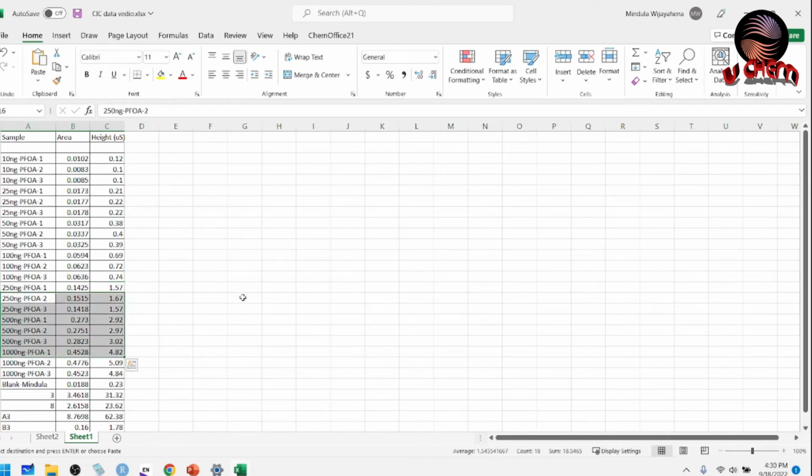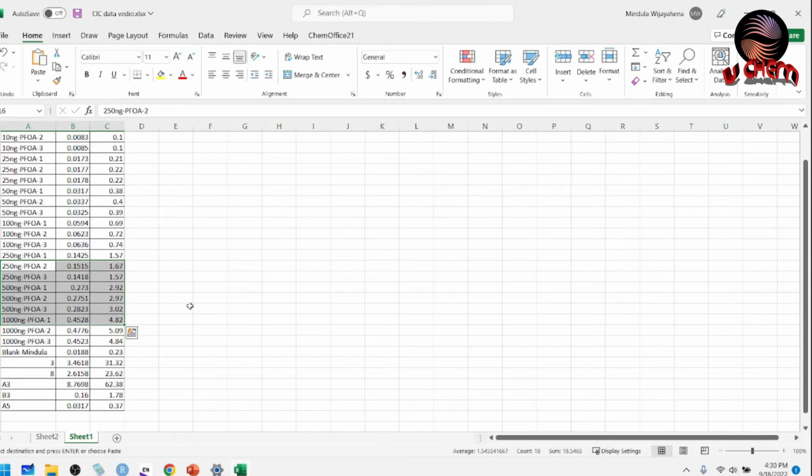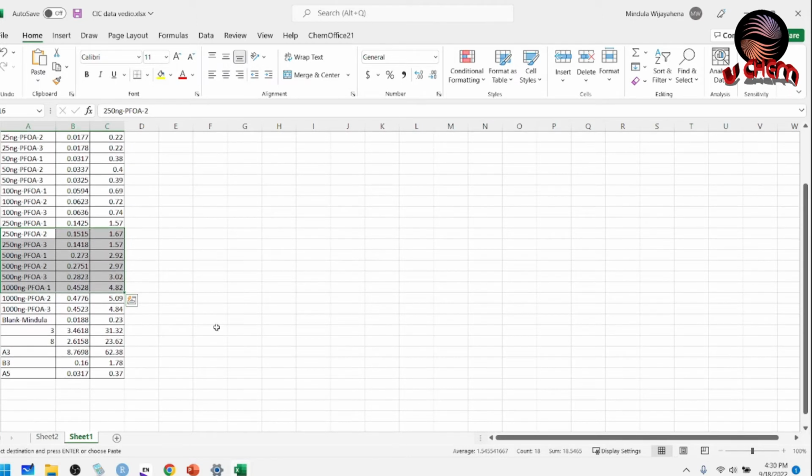It will differ depending on whatever you want to do, so it's totally fine. It could be a chromatogram, it could be an absorbance value for a particular concentration. It doesn't matter. For calibration curves, we are giving the instrument known concentrations and asking for the corresponding signal.